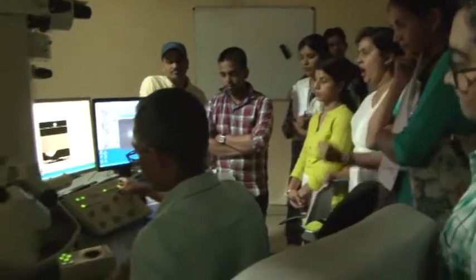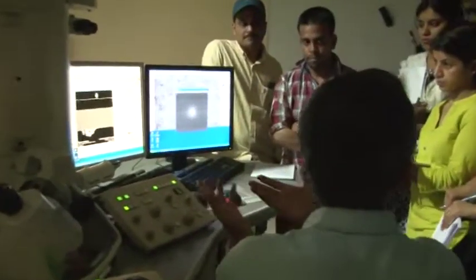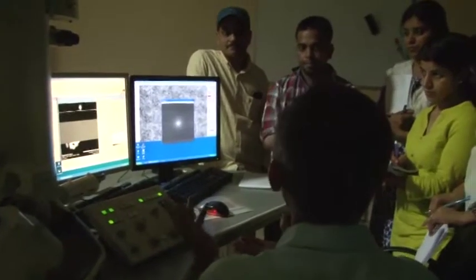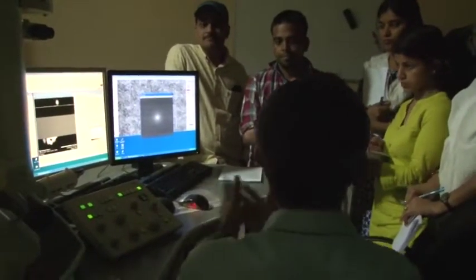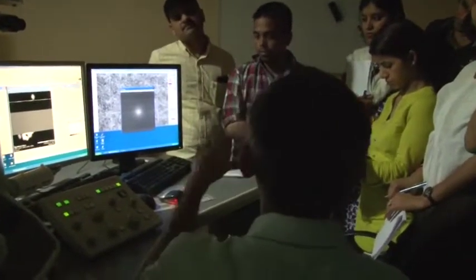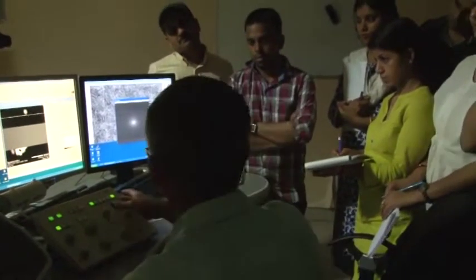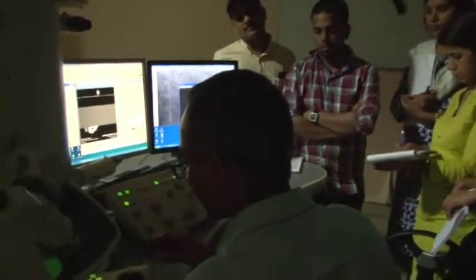Okay, so let's identify some of the sample now, which is nanoparticles in this case, and we'll just acquire. We will see if there is an area where there are numerous nanoparticles. It will be possible for us to get a diffraction pattern, and let's try to acquire one, or at least try to identify.